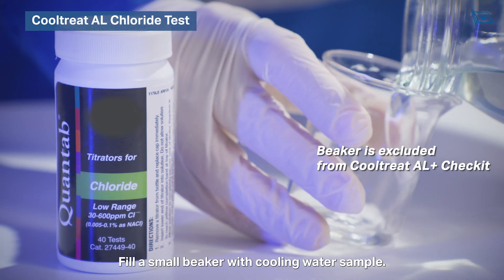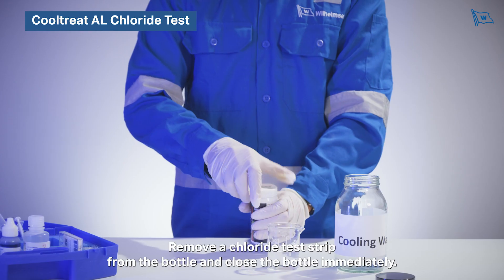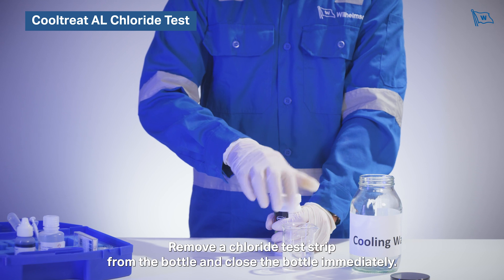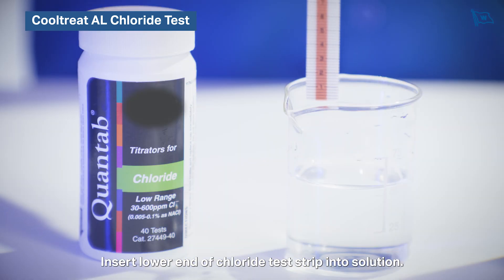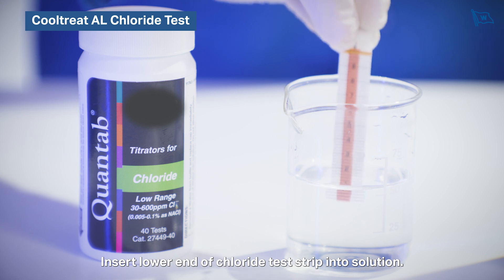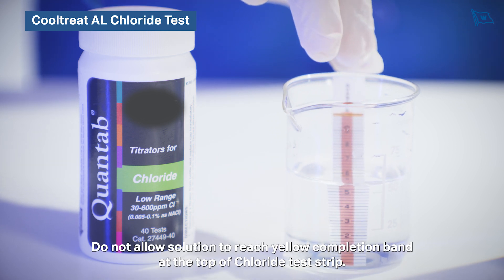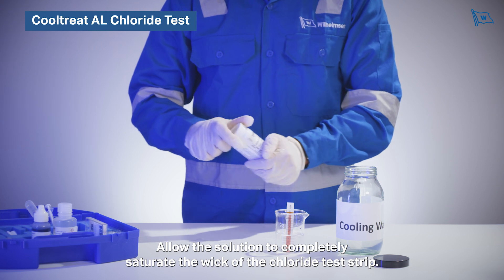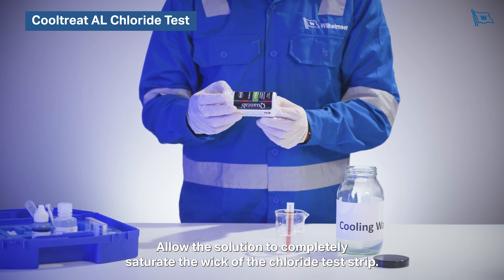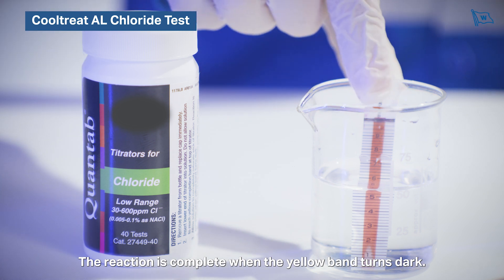Fill a small beaker with cooling water sample. Remove a chloride test strip from the bottle and close the bottle immediately. Insert the lower end of the chloride test strip into the solution — do not allow the solution to reach the yellow completion band at the top. Allow the solution to completely saturate the wick of the chloride test strip. The reaction is complete when the yellow band turns dark.